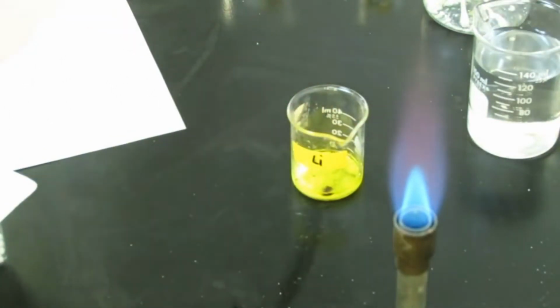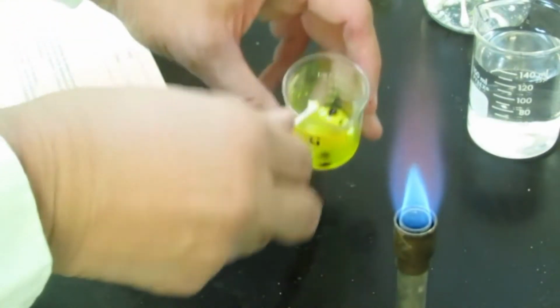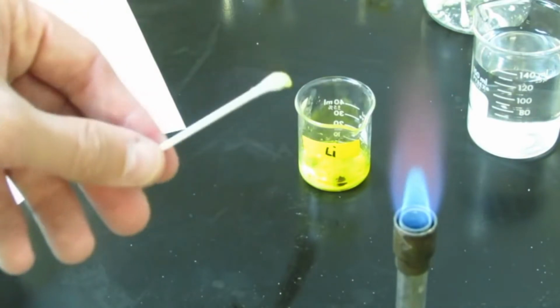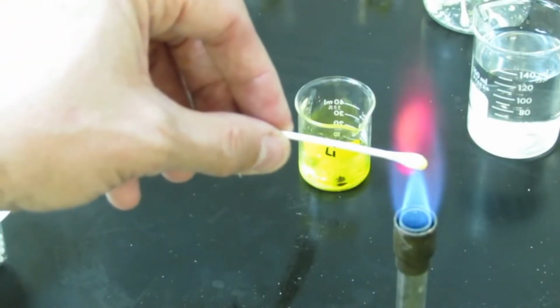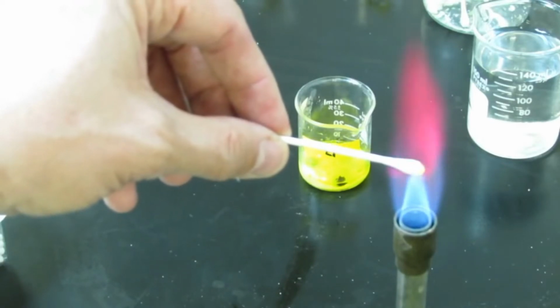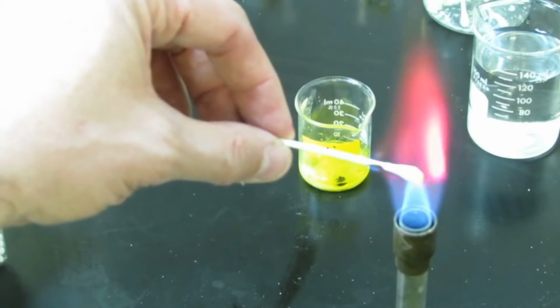It's a little hygroscopic. It's gotten a little moist over the past couple of days. Get that wet. And we'll put that in our flame. There we go. Okay, so that was our lithium salt.